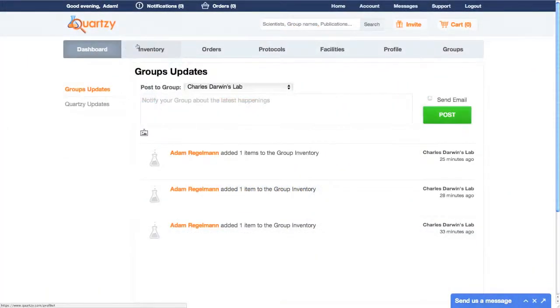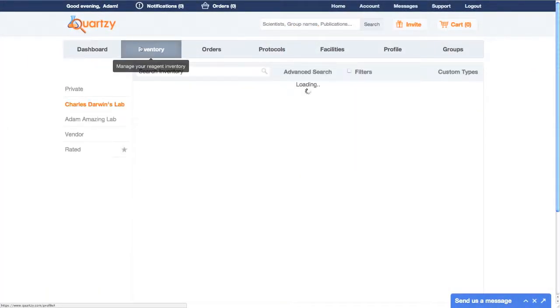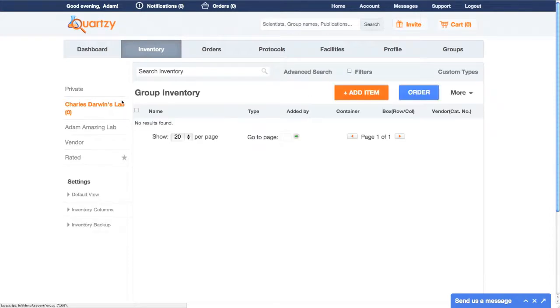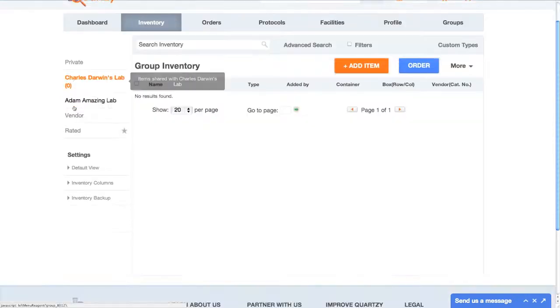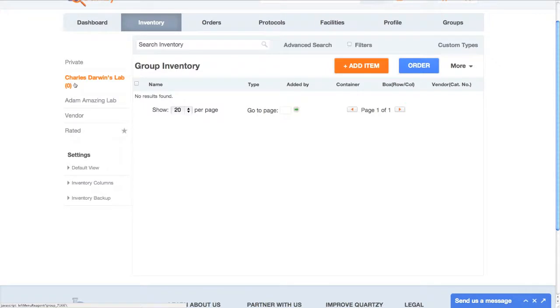To get started, just click the Inventory tab and you'll be taken inside. If I look over to the left, I can see two inventories: a private inventory, which is for my eyes only, and the inventories of the groups I'm a member of — in this case, the Charles Darwin Lab.